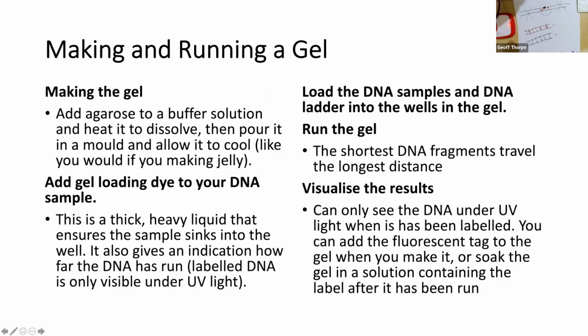So let's quickly go through all the steps in making and running a gel. First of all, making the gel is much the same as if you were going to make some jelly. You add your agarose to a buffer solution, heat it up so it dissolves, pour it into a mold and then allow it to cool. So as I said, pretty much like you would do if you're making jelly.